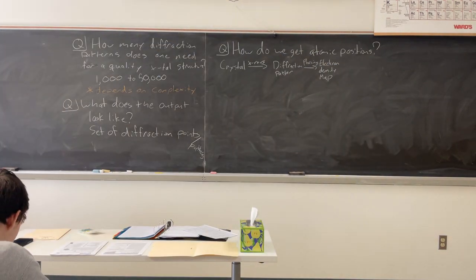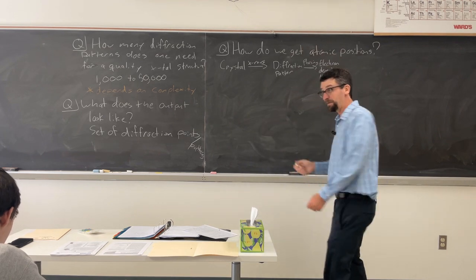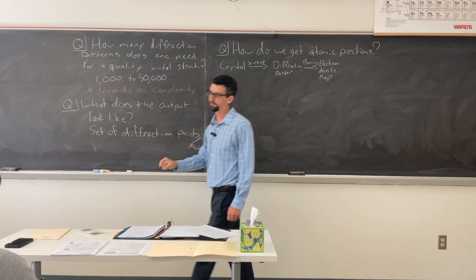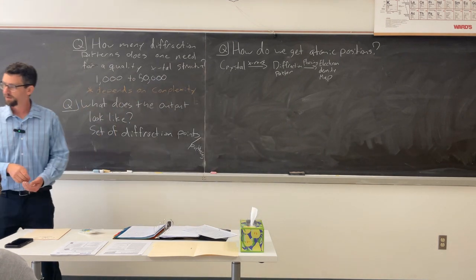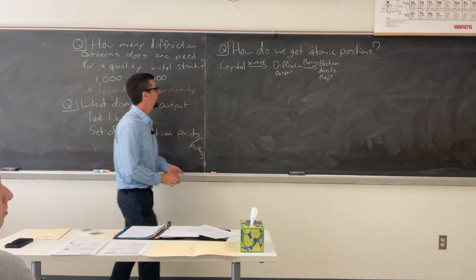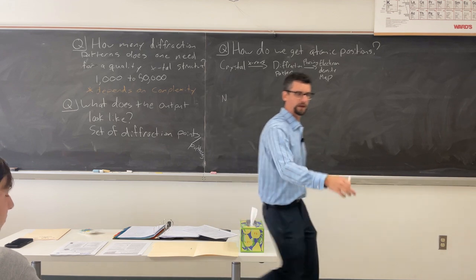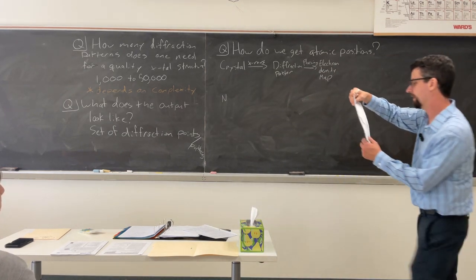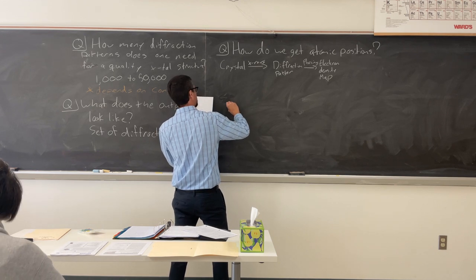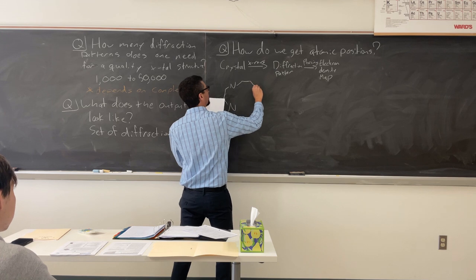Go down. It's a porphyrin. It's a tetraphenyl porphyrin with a metal in the center. Yeah, sort of like hemoglobin. So it's a ring that has, can I steal your paper for a second just so I can draw the orientation? So nitrogen, blah, blah, blah. Nitrogen, blah, blah, blah.